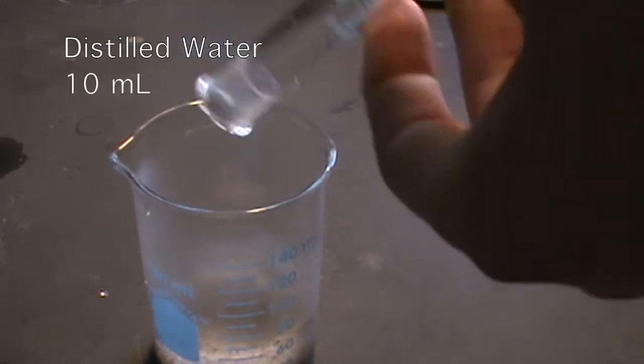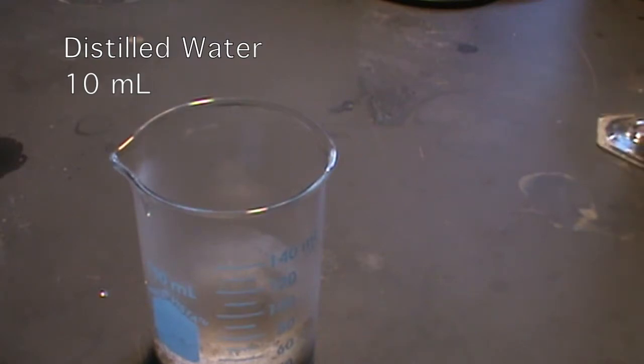An additional 10 milliliters of distilled water was added because the slurry was too thick to swirl properly.